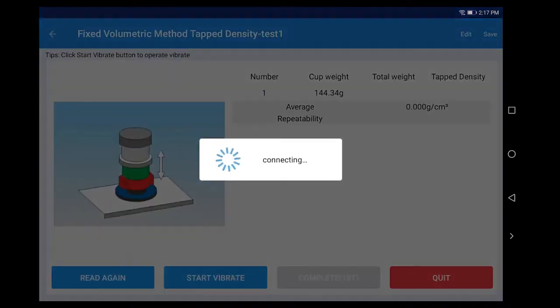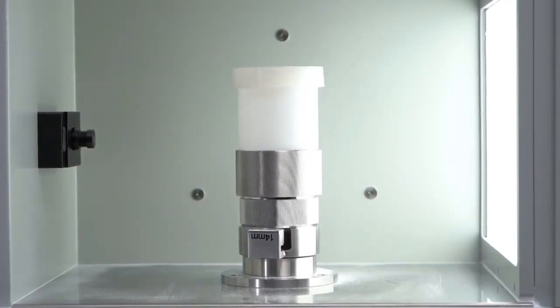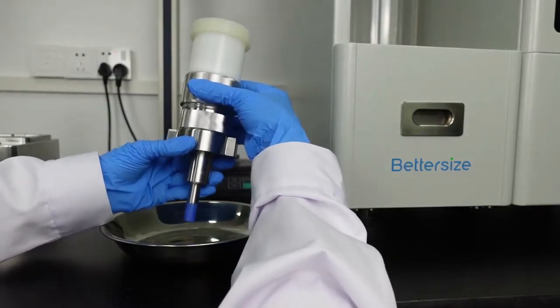Click the Start Vibrate to start vibrating and stop vibrating when the preset vibration times reach. Take out the tap density assembly.